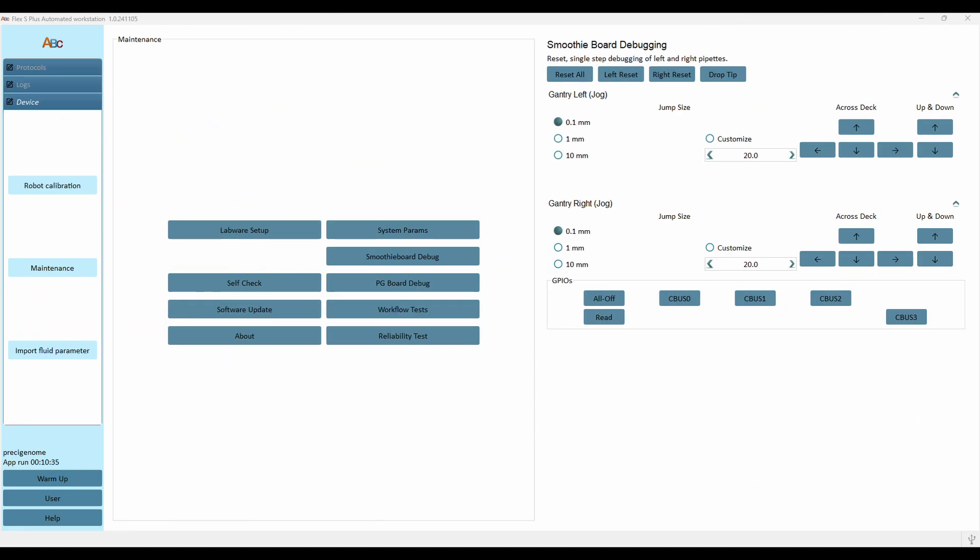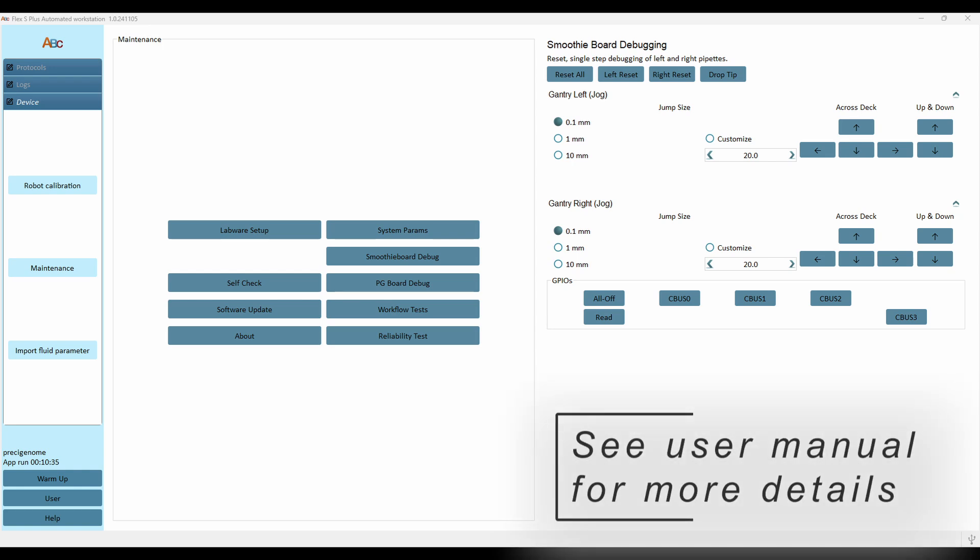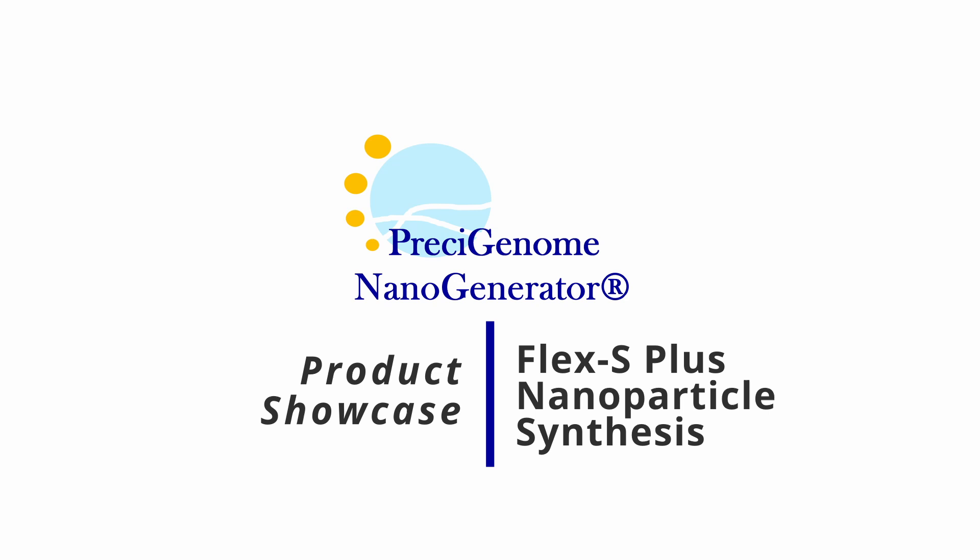Finally, several diagnostic options are present to ensure maximum reliability for the workstation components. Combined with the instrument's robust hardware, these features empower users to produce controlled and repeatable results.